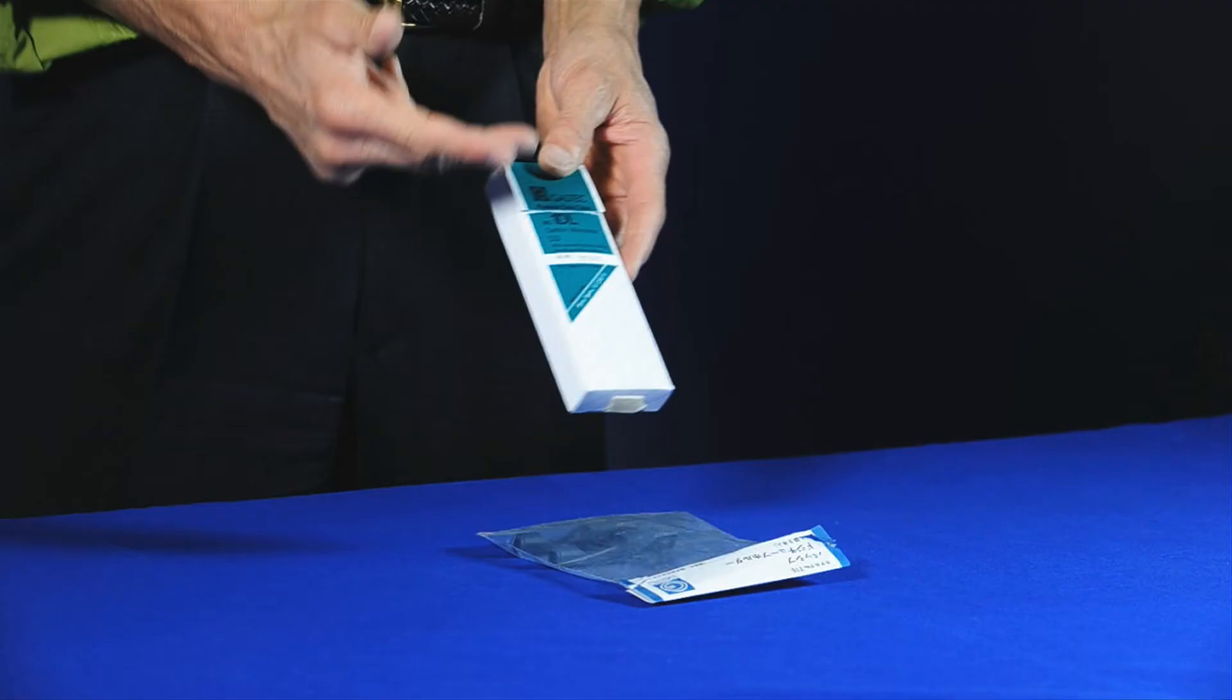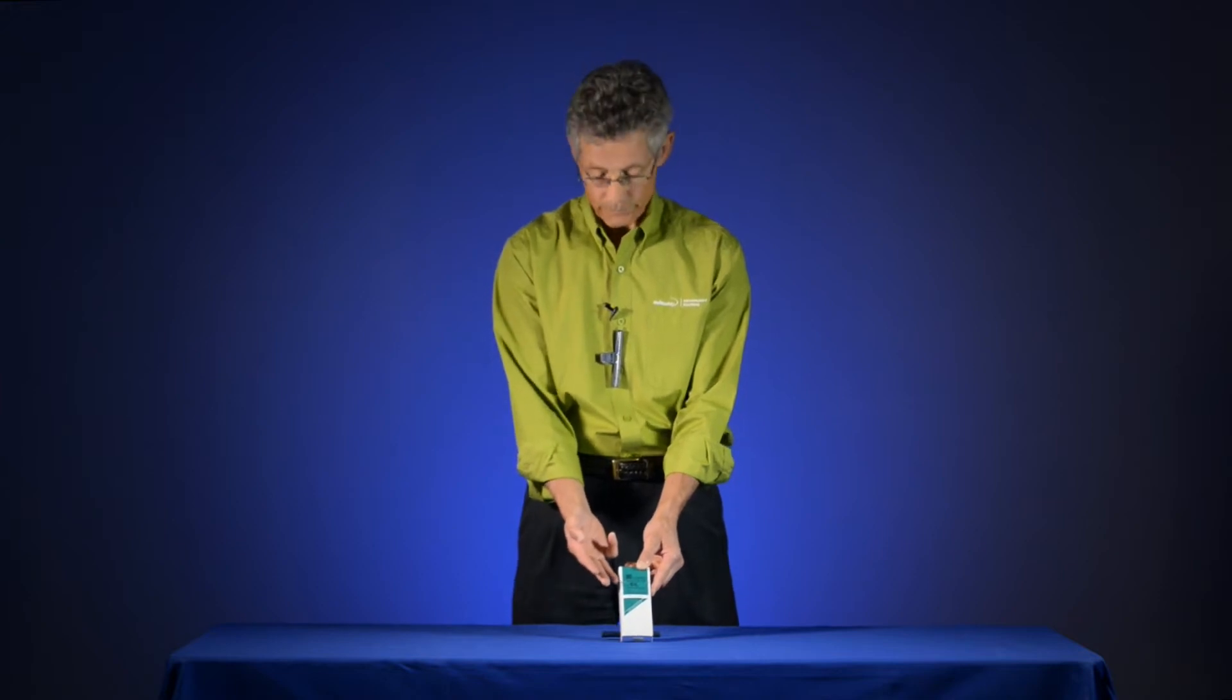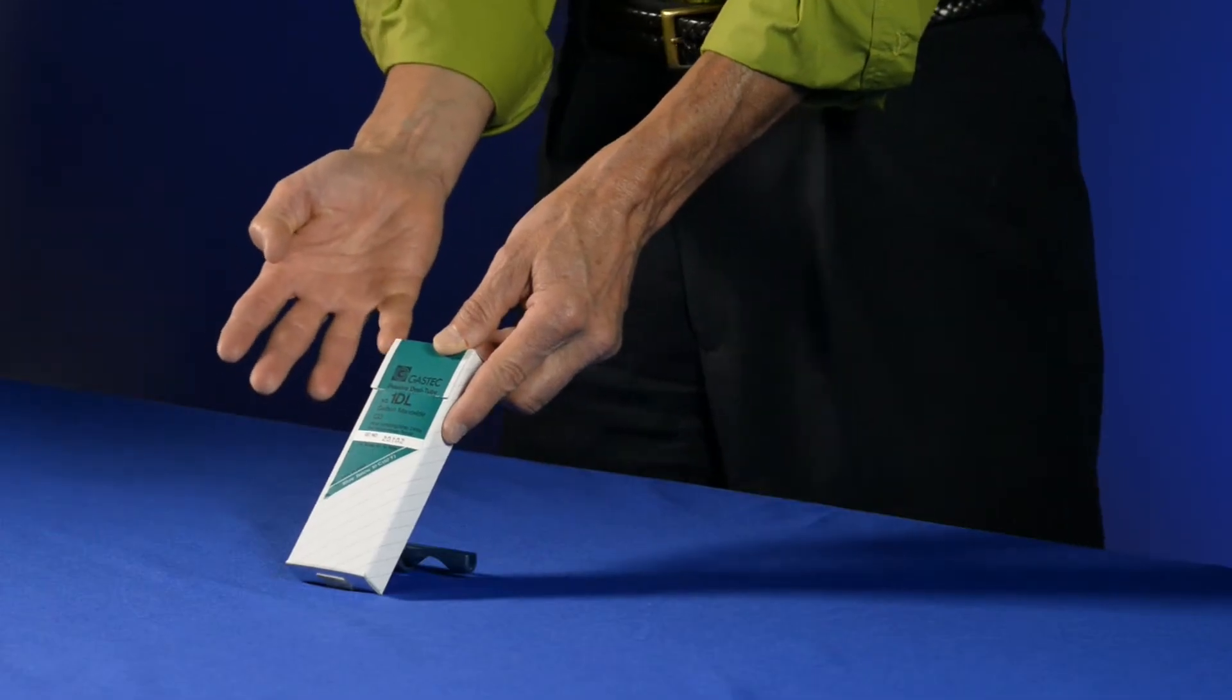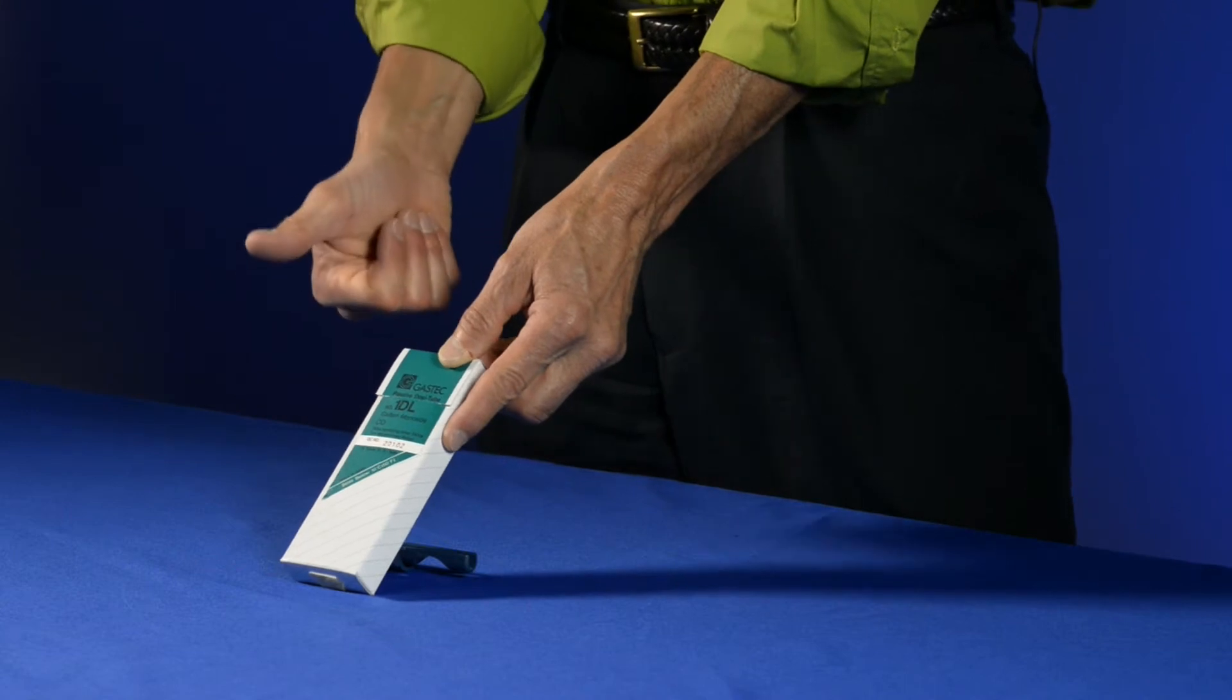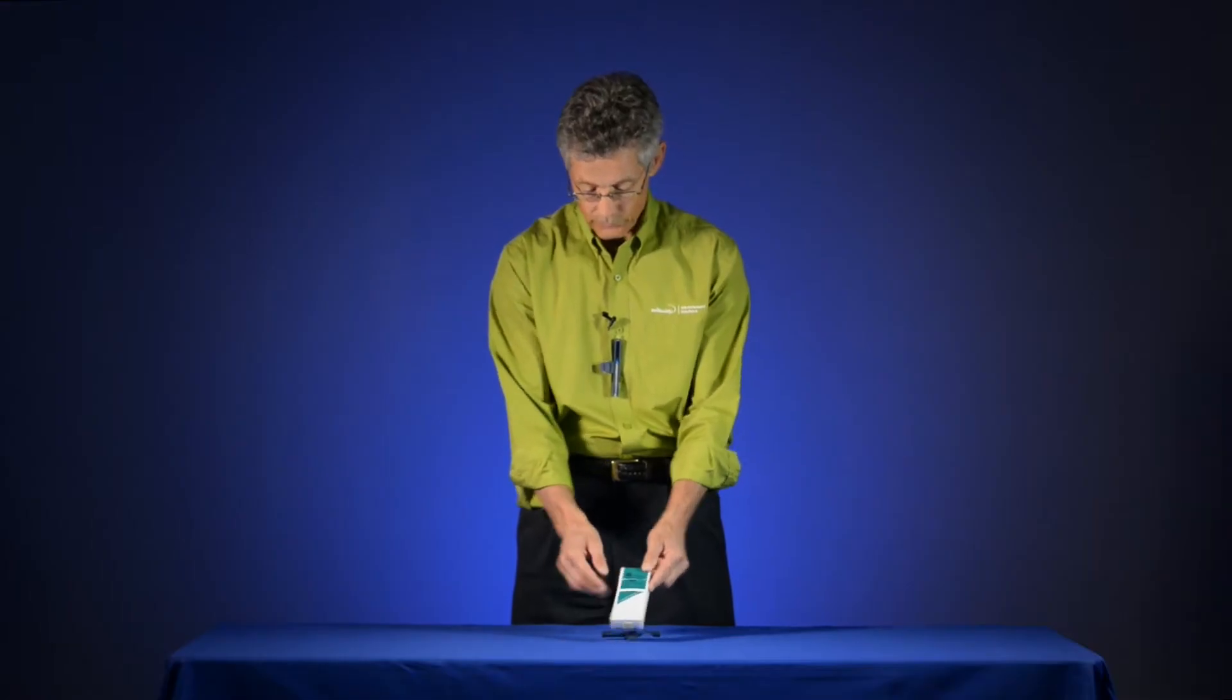So by design, they're intrinsically safe. There's no batteries required. They're very easy to use by non-technical people. They give you an immediate result. And there's no regulators or calibration gas required to use the DOSI tube.